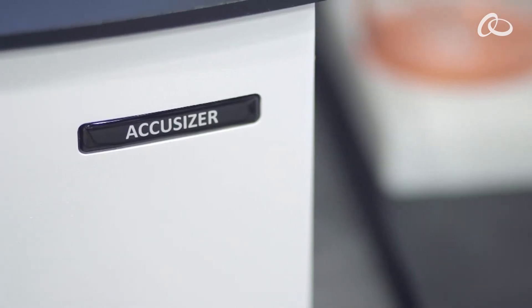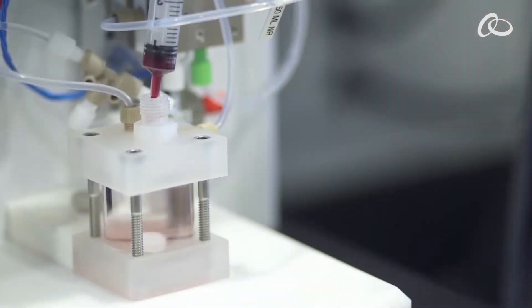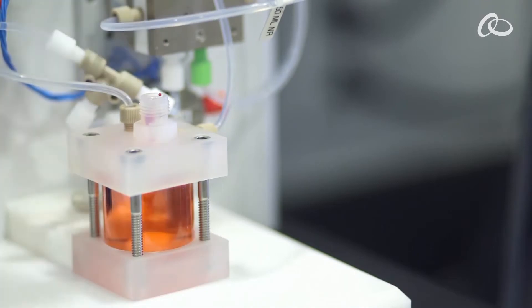Introducing the AccuSizer, both a liquid particle counter and a sophisticated high-resolution particle size analyzer.